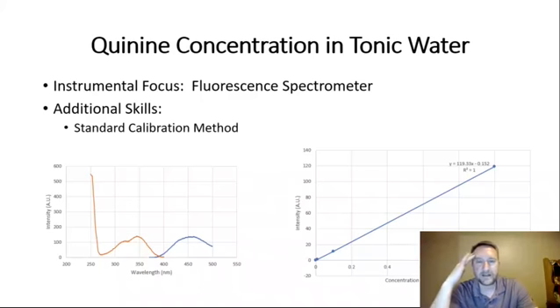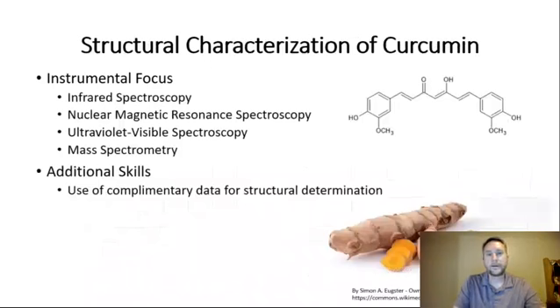It's kind of fun because you get to see the tonic water fluoresce, and if they'd never seen tonic water emit that beautiful blue color that it does when you expose it to UV light, it's kind of fun from that perspective. But one of the students, and I'll show you this as we get towards the end of this discussion, took this idea and brought it into her capstone experiment as well.